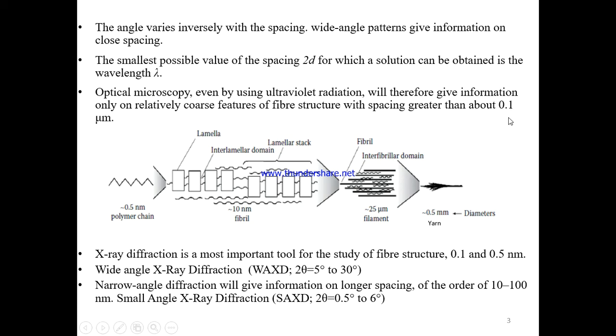So you cannot measure what is inside the fibril, the dimension of lamella or micelle, or whatever molecular orientation or molecular order is present inside a single fibril.